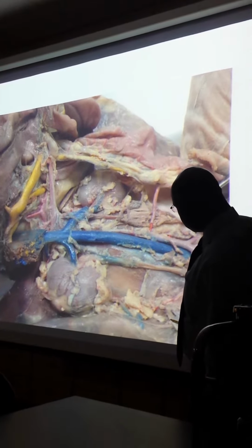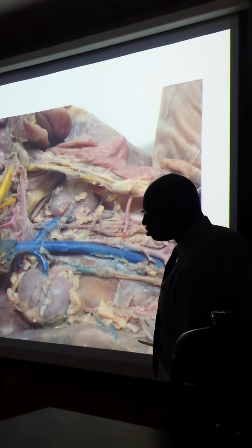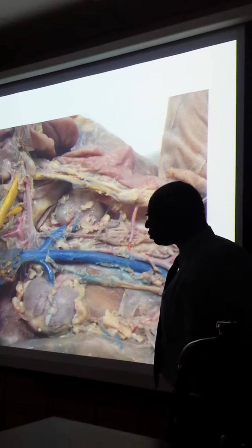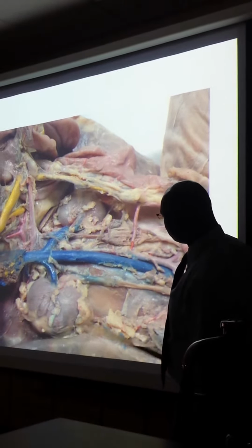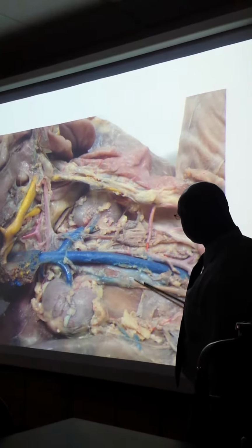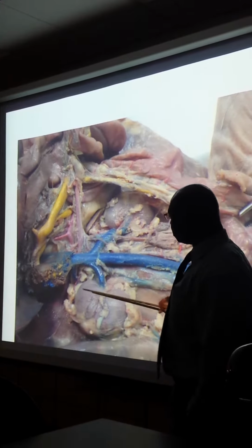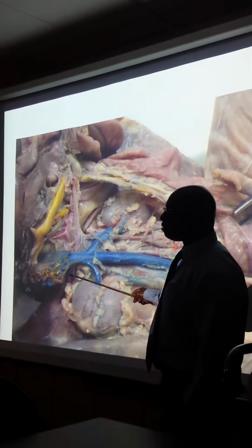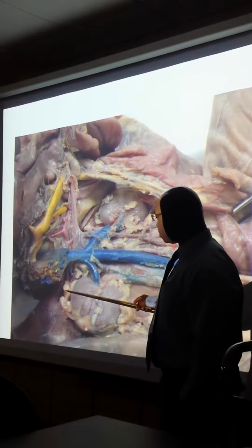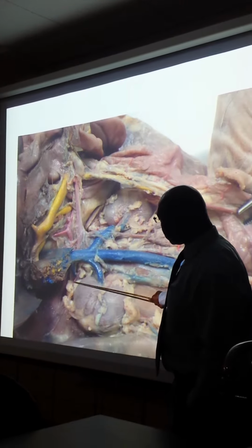And I think when they did this incision and sutured it up with that thick string and stuff, they pulverized the internal spermatic vein, we'll look for it on the other side. But anyway, if you have the vena cava, and you get the renal vein over here, and then you get the adrenal lumbar vein going to the adrenal gland over here, all right? Artery over here.